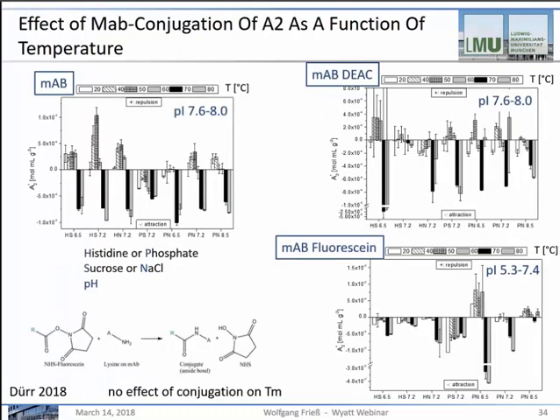the interface. One last study was on mAb conjugates, using the A2 as a function of temperature to understand the behavior. This slide is rather busy, but I just want to point out a few small highlights. So we see the mAb, cetuximab again, at different temperatures, and we see that, for example, in histidine with H, in the presence of sucrose, S at pH 6.5, with ramping up the temperature, KD decreases.